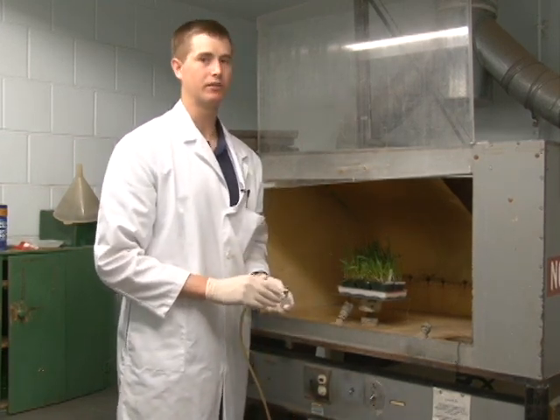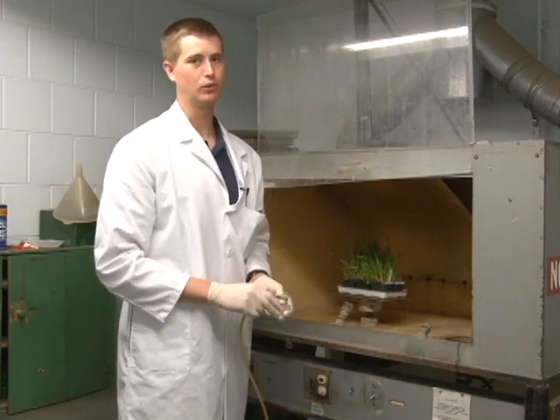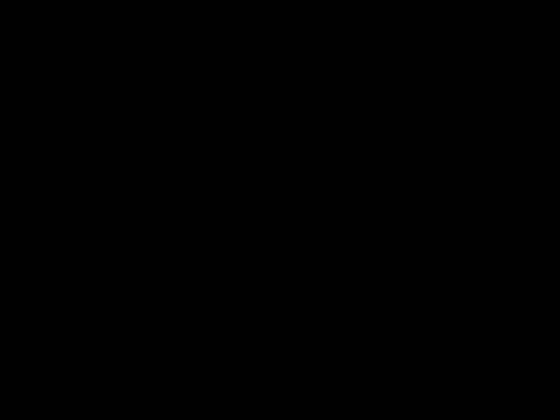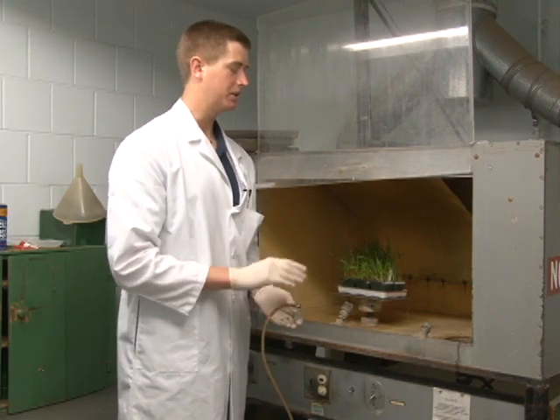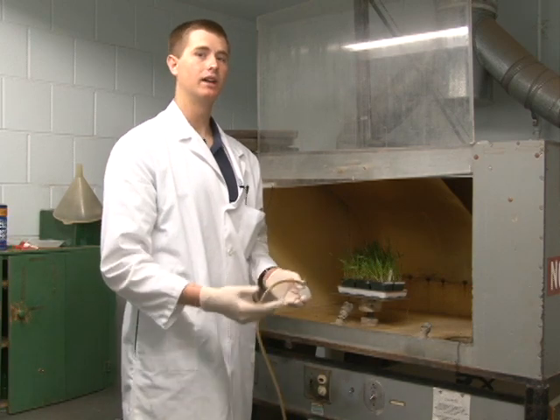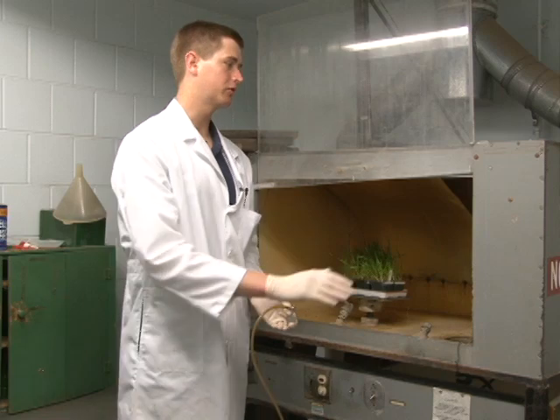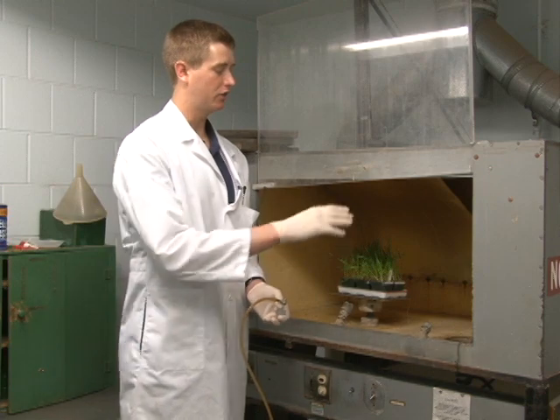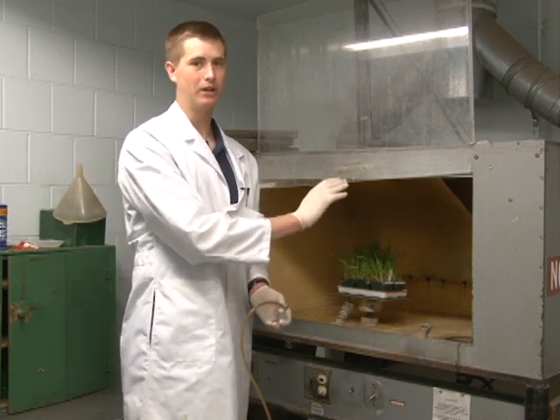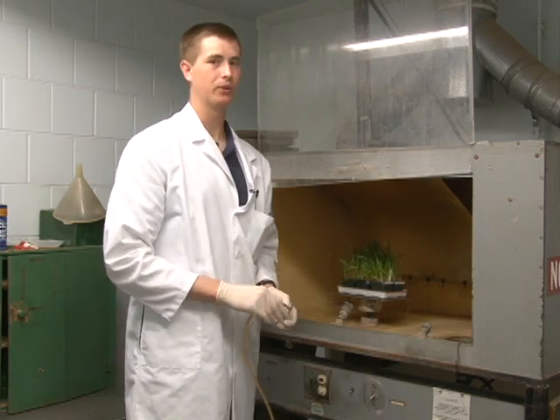After you've inoculated your plants, you need to take the tray out of the inoculation booth and begin to dry it. If you are inoculating more than one isolate of rust, you need to sterilize the inoculation booth before you begin another inoculation. In order to do that, you can simply spray down the inoculation booth with water, which will cause all of the spores floating in the air to be caught by the water and taken to the sides or the bottom of the booth.